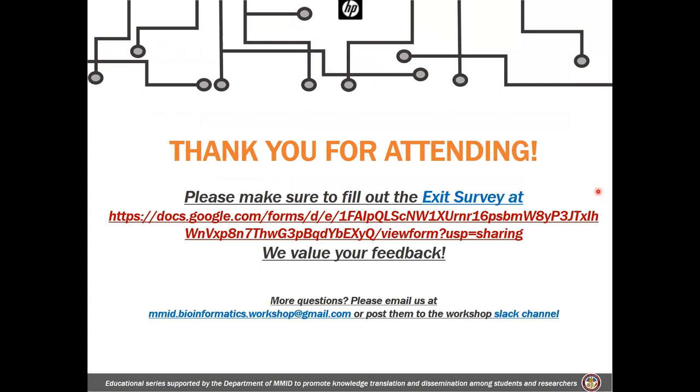So the FASTQ data sets that we had processed through the workflow that we did today, those will be the ones where we filtered the host genome, so it'll be the dash HR at the end. Yes, the ones that we made today. That'll save people a lot of time from having to re-download data sets and taking up space on your computer. I'm trying to make it as efficient as possible for everyone, because I know we have a lot of stuff on our computers.